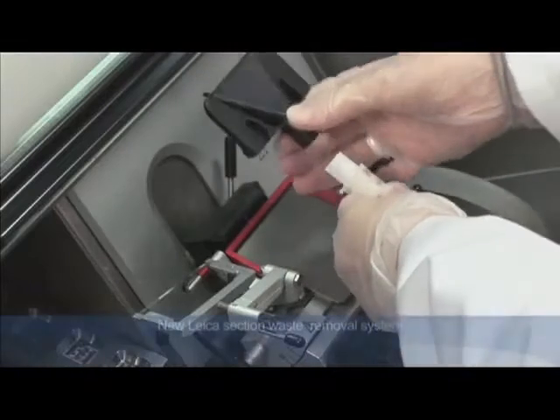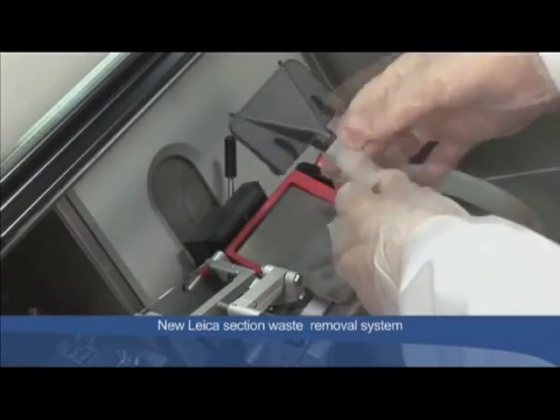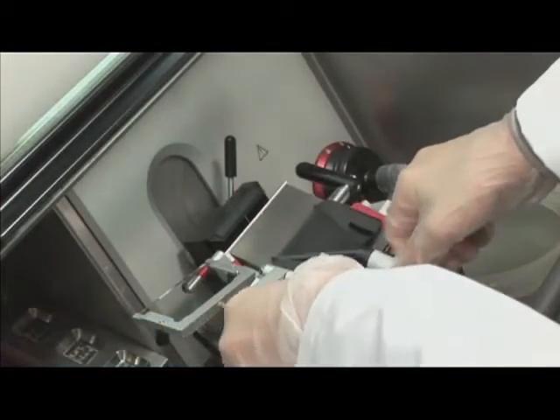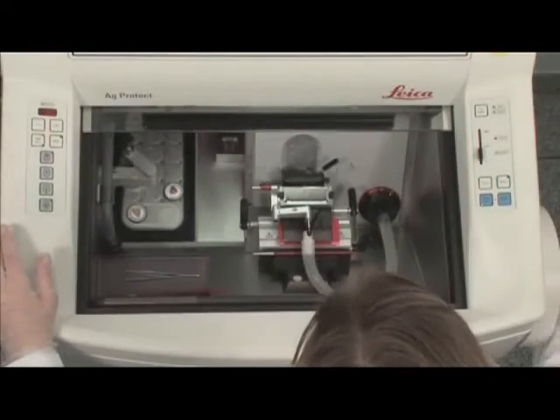The new vacuum system of the Leica CM1950 provides section waste removal via an integrated filter system. Depending on the preferred mode of operation, manual or motorized trimming is possible.